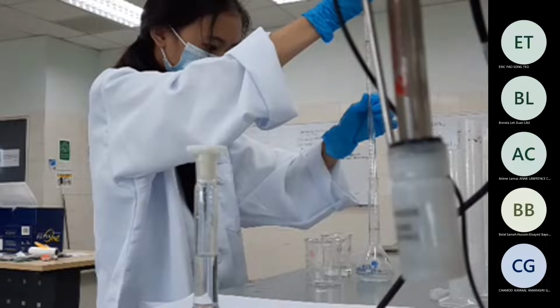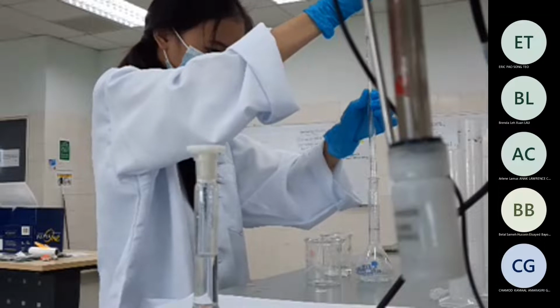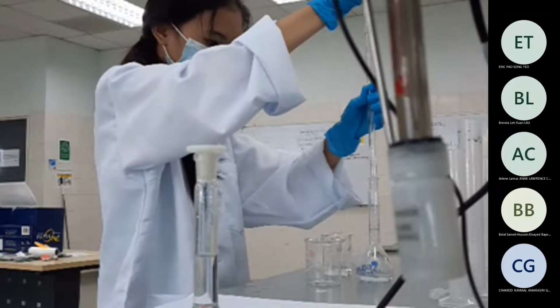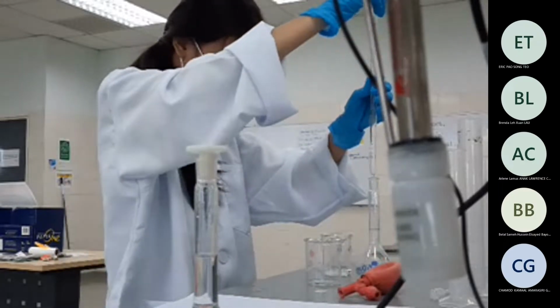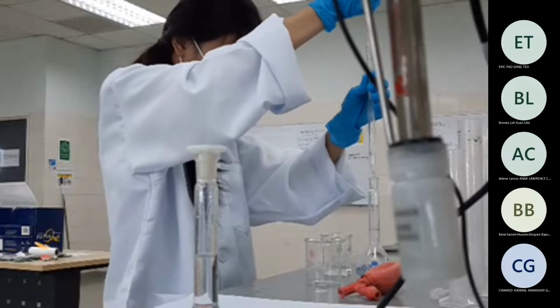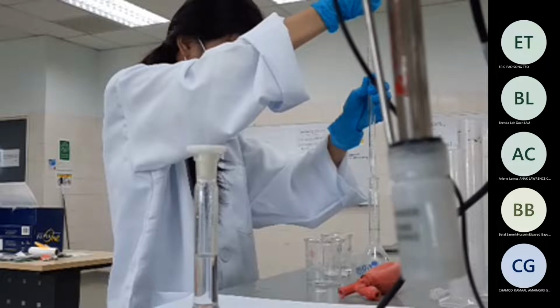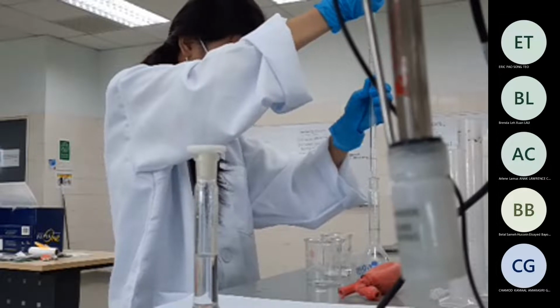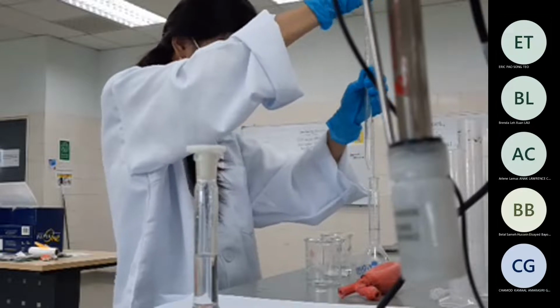How is it, Lynn? Done both? Okay. It's so dangerous to put here, move it a bit here, like this. Okay, so now we do not need these beakers anymore. So discard this, and later on we will need this beaker. We will be using this beaker, just discard it and then wash it with water.